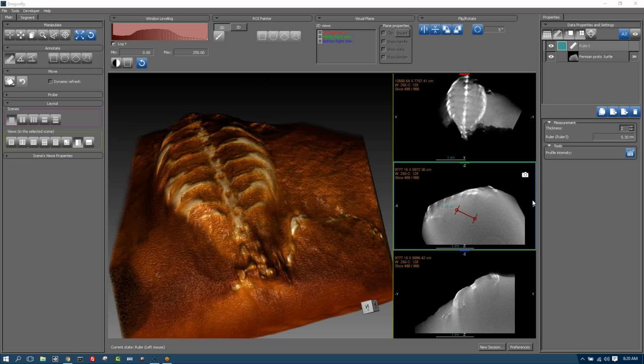We also did a modification of the image reader, and so now you can write Python code to write a new image reader. We used that to write an image reader for a VISO file format. We also have imports of volume graphics. There are two different formats for volume graphics that we know about, and we're supporting both of them now. And it also means, as I showed you in the beginning, you could crop data on import. Even when you write your own Python extension for an image reader, that gets supported out of the box.